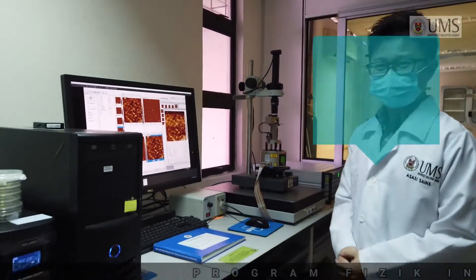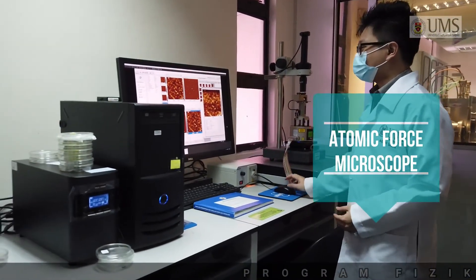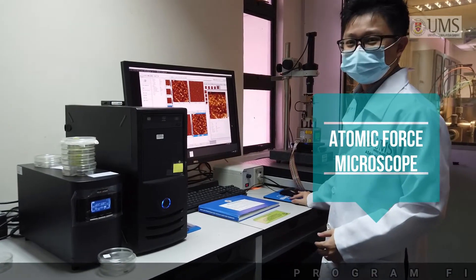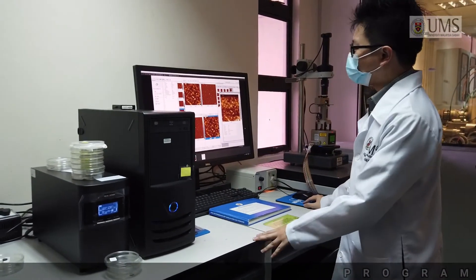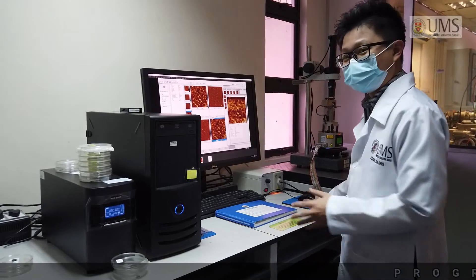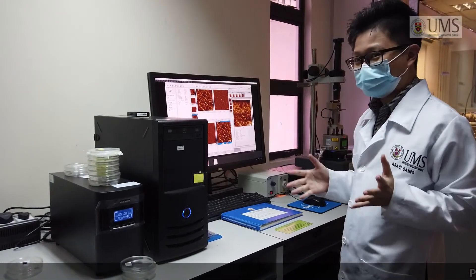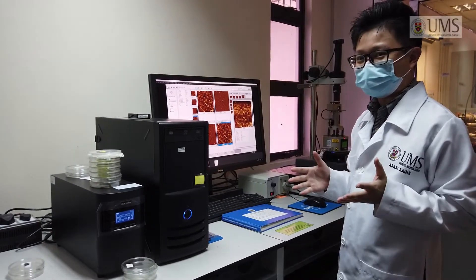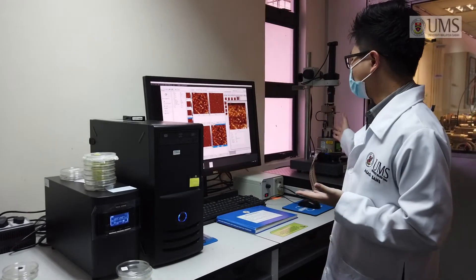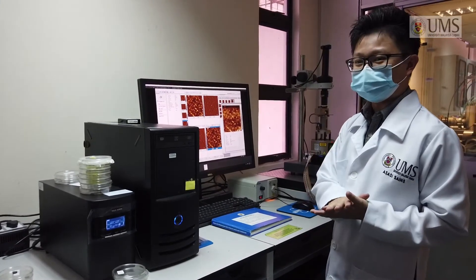Hello, and a very wonderful day to you. As you can see, this is our atomic force microscopy. The atomic force microscopy works in a way that it actually detects the surface topological of a sample. So, if you have any samples that you're interested in testing, we use the atomic force microscopy that can go all the way up to nanometers.